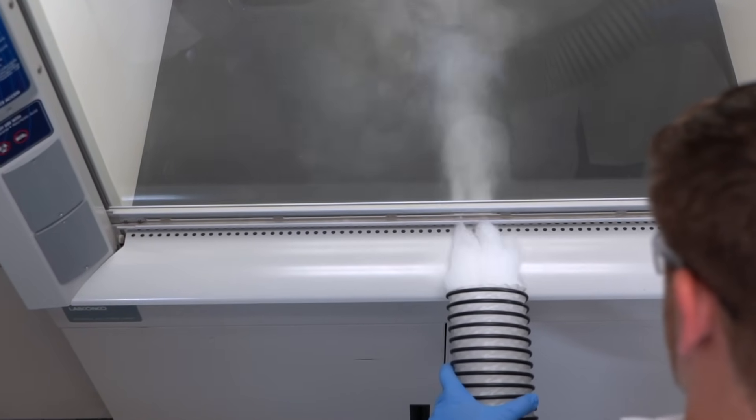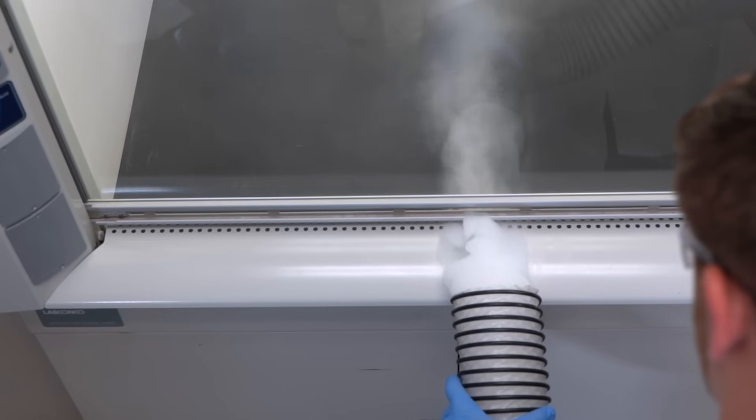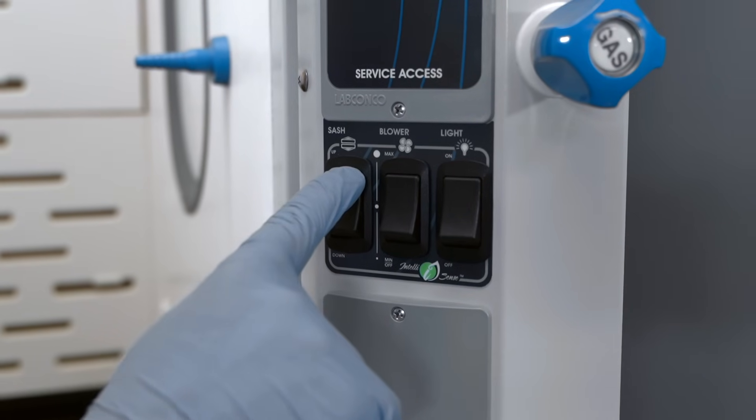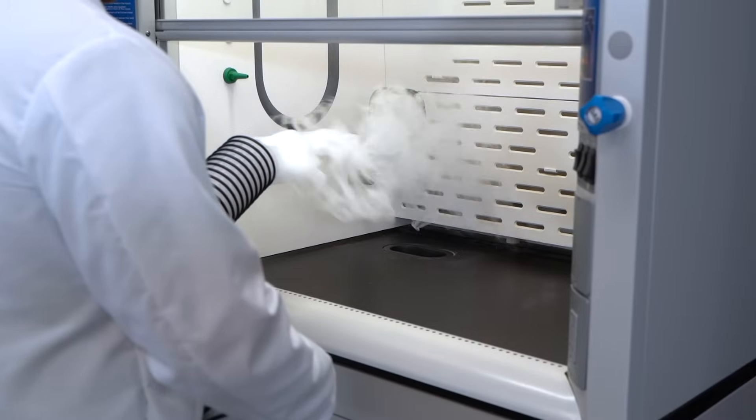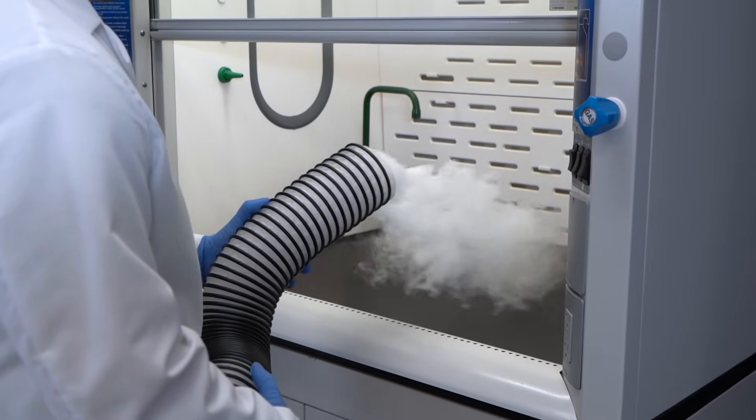Smoke can be used to visually verify a hood's containment ability. With the sash in the fully open position, smoke should be exhausted evenly from all areas of the hood.